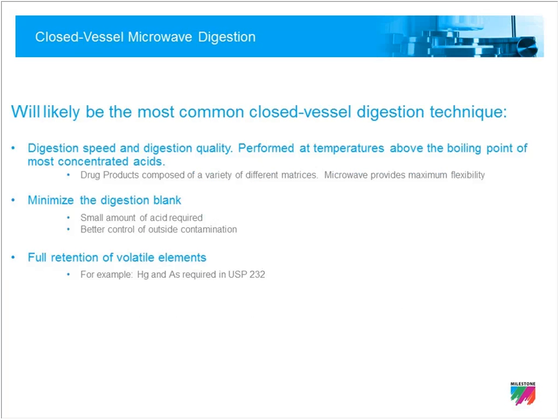Now, I'll note that USP does not specify closed vessel microwave digestion as the technique to use. A lot of labs are going this route, and the reason for that is microwave digestion is a very mature technology. It's been around for a long time, and for good reason. One is the digestion speed and the digestion quality are very high.